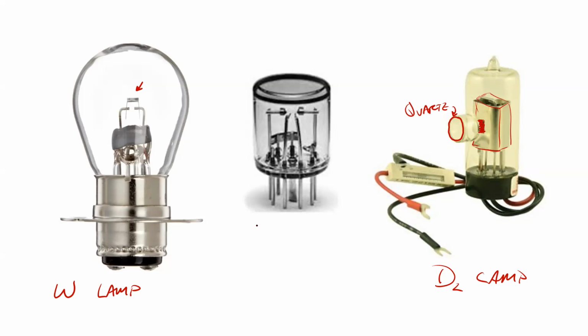This one in the middle, is that an LED or is that our xenon flash bulb? I'd say an LED, just a guess. Anyone else? Maybe it's xenon. Xenon bulb. Yeah.